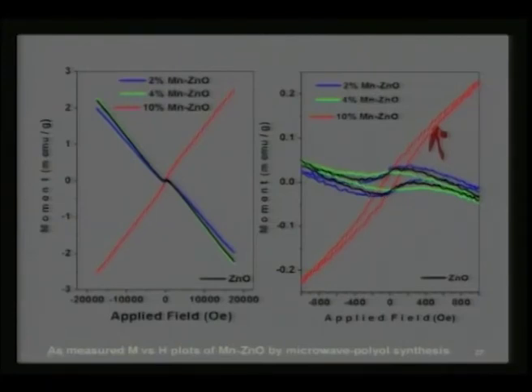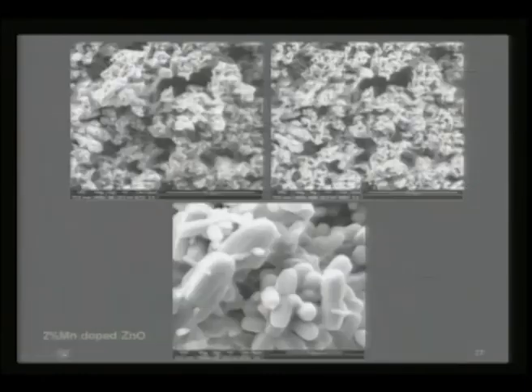But when you have a 6 line spectra, in all those cases you still see a diamagnetic contribution more pronounced. Therefore we need to be very cautious to say whether manganese is clearly doped or not. If it is clearly doped, we do not see a strong magnetic feature as we have seen in other cases, but when there is a manganese interaction, then you again see something as what is reported.